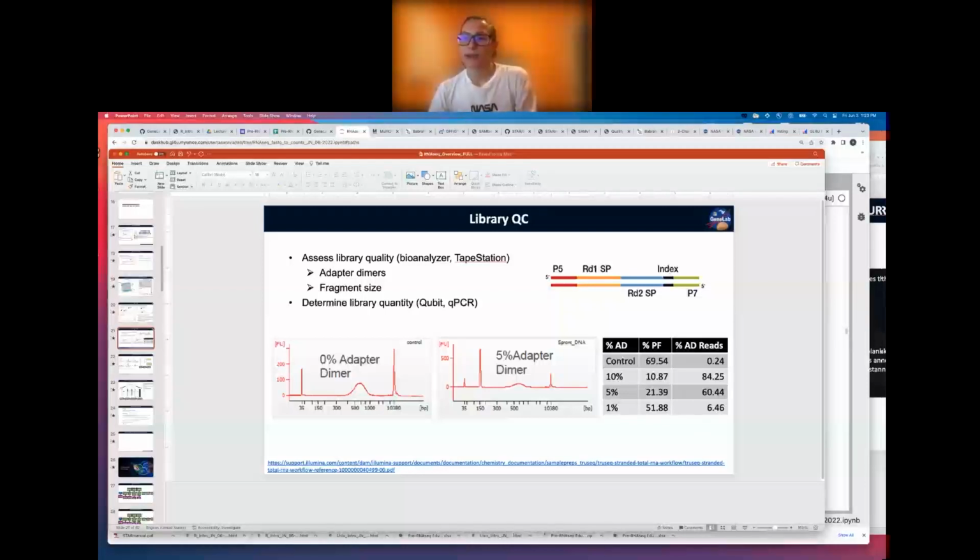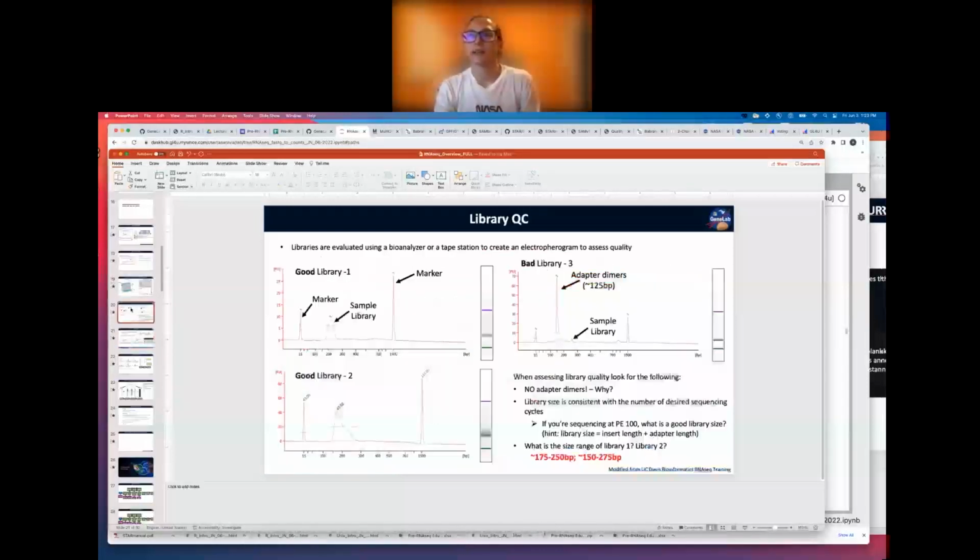Does it happen a lot, like every time that you have to rebalance after the iSeq run, or is it rare? It's pretty common. Good question. It's pretty common just because it's very difficult to account for how it's going to play out on the run. I guess we could do a more thorough assessment of the range here and try to guesstimate based on how we're seeing this smear end up. But almost every time we have to do some rebalancing.